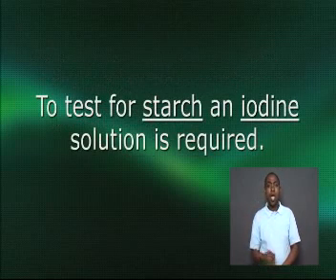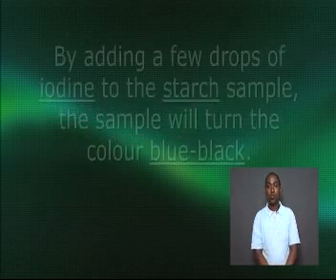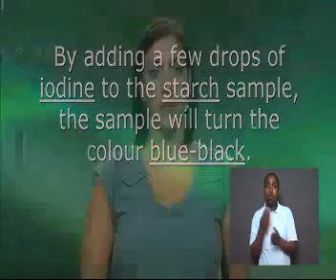An iodine solution is required to test for starch. By adding a few drops of iodine to the starch sample, the sample will turn the color blue-black.